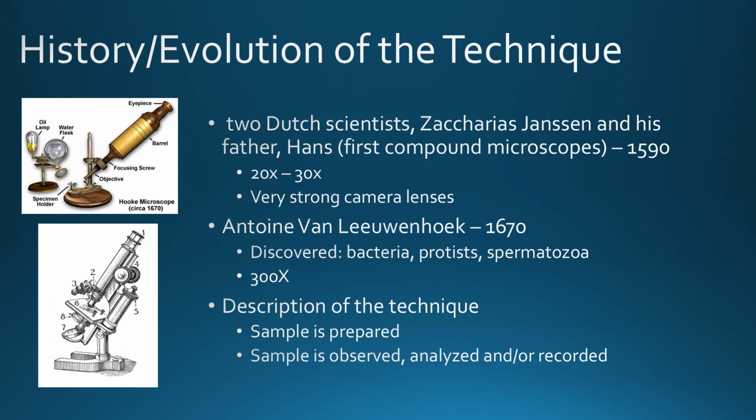Basically, the technique itself has not evolved as much as microscopes have evolved. What I mean by that is the technique has always essentially been the same. A sample is obtained, a sample is prepared, a sample is observed, and it is analyzed and recorded and documented in various ways.